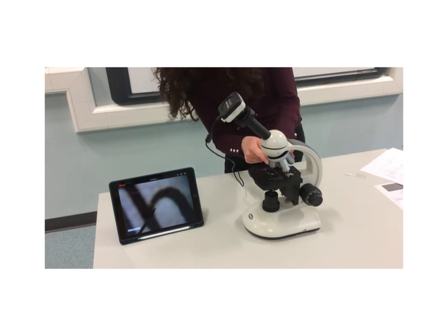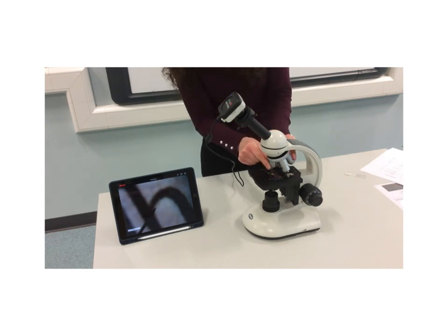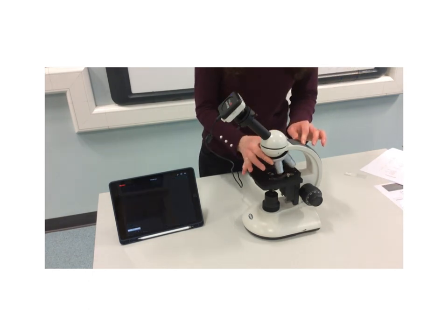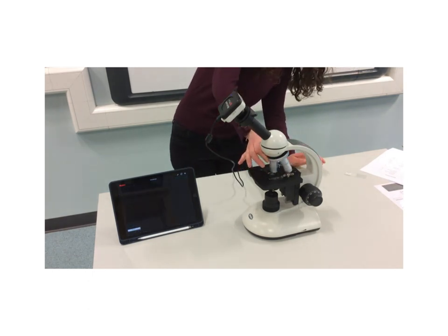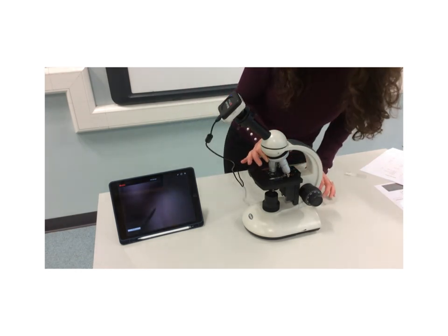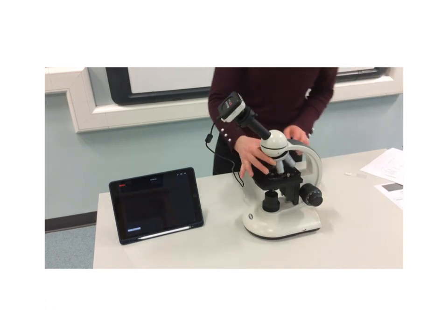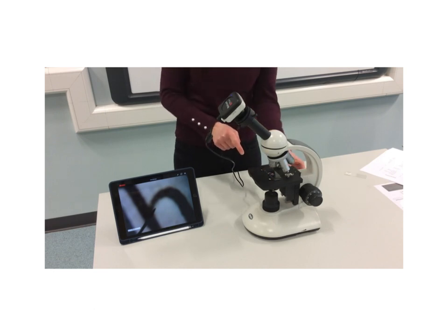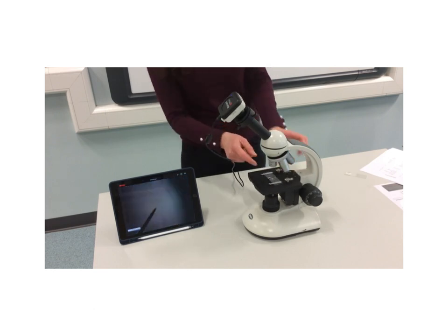But then if you remember, we have 3 other lenses down here, and these are called our objective lenses, and we can use what we call the turret to turn these. Now I've got to make sure it doesn't make contact with my slide. But that will then bring it into a greater magnification. You can see the one over the image at the minute is the smallest. If I bring this right down, I'll be able to turn them all fully.